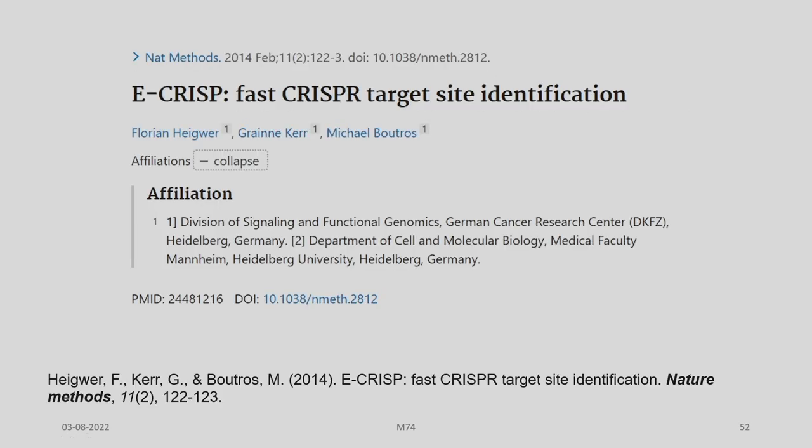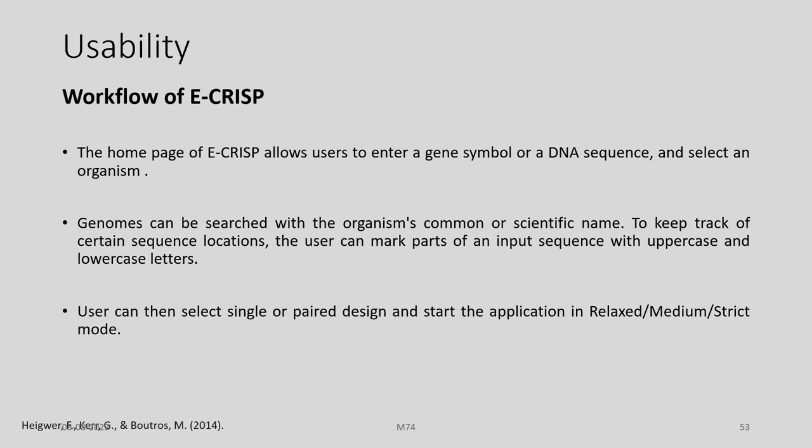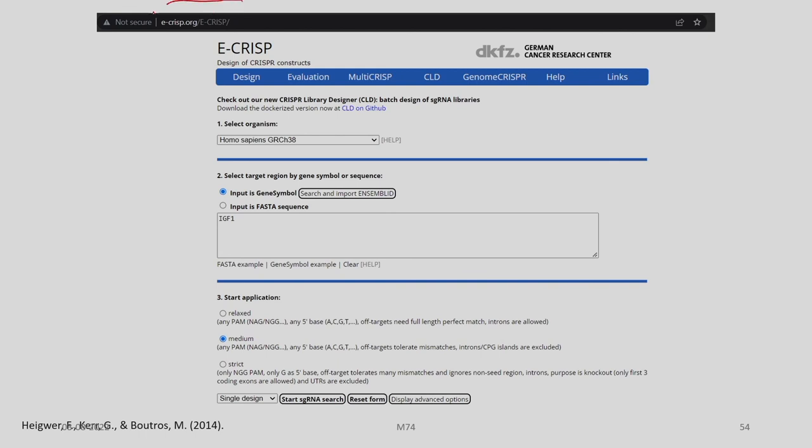E-CRISP, developed by Heigwer and colleagues, is used for fast CRISPR target site identification. The home page allows users to enter a gene symbol or DNA sequence and select an organism. Genomes can be searched by common or scientific name, and parts of the input sequence can be marked with upper or lower case letters. The website is e-crisp.org, hosted by the German Cancer Research Center.